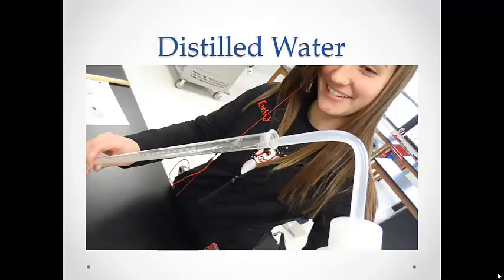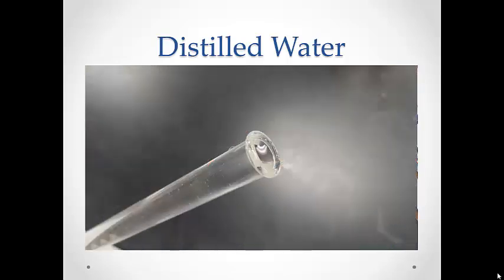Back at your lab station, use a squirt bottle to very slowly and very carefully add a layer of distilled water on top of the acid. Tilt the gas measuring tube at an angle and gently squeeze the water so it flows down the side of the tube. Fill the tube all the way to the top with distilled water.